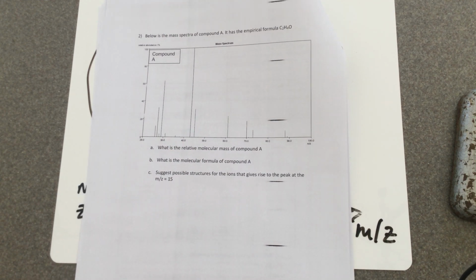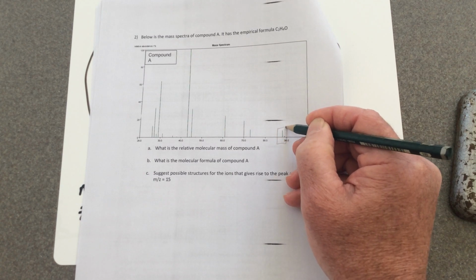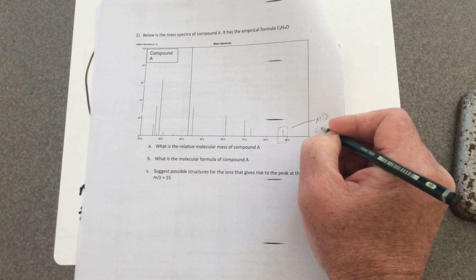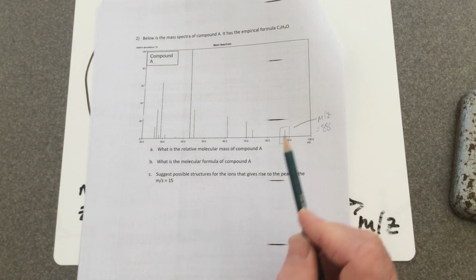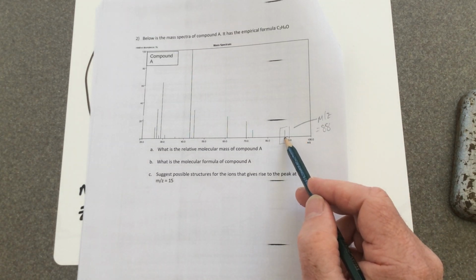Okay, what do we do? I can see up here at MZ equals 88, there is a peak. There's a really, really tiny one at 89. That's going to be caused by isotopic variation. That's going to be caused by a molecule with a carbon-13 atom. So I'm going to ignore that. I'm interested in the 88.